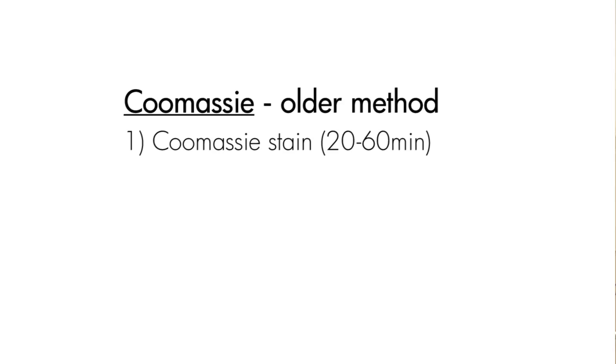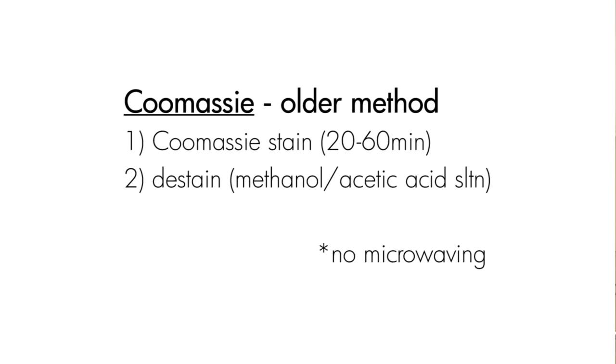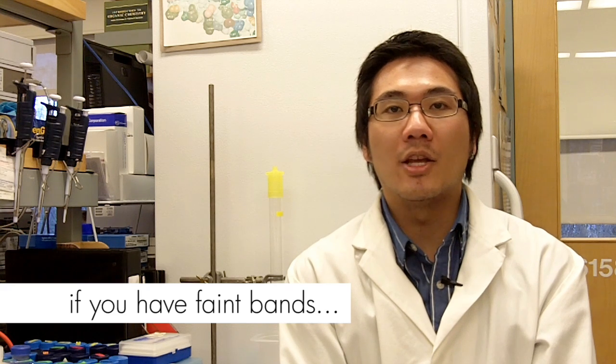So that's how you stain your gel using Page Blue. Now I'm going to tell you how to stain your gel using Coomassie. You first of all take your gel and put it directly into your Coomassie stain. The staining time is about 20 to 60 minutes. After the staining is done, you take your gel and transfer it into a destaining solution which is made out of methanol and acetic acid. For this protocol, you do not need to microwave, but it does take a little bit longer compared to Page Blue.